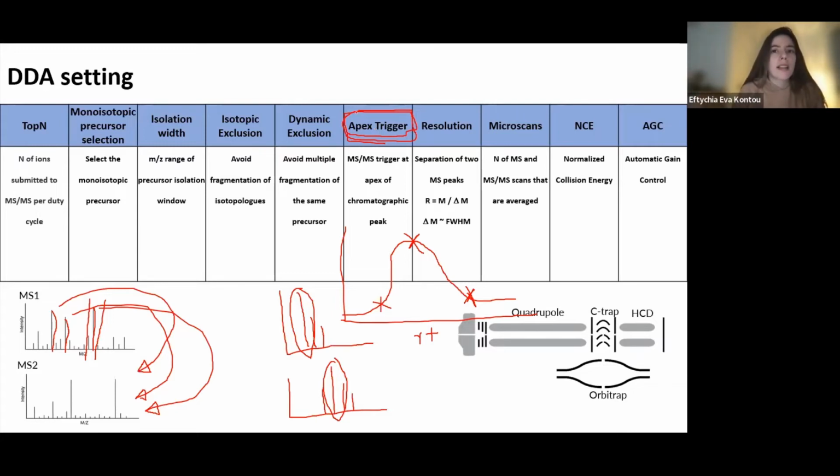And we have an IDX, so I don't know if we have that. I think you should probably have that there. And the settings are relatively simple, so it does not say too much about its actual algorithm, so how it defines the apex. I think you can just define the minimum and maximum wait time, which corresponds a little bit to the peak width you expect.